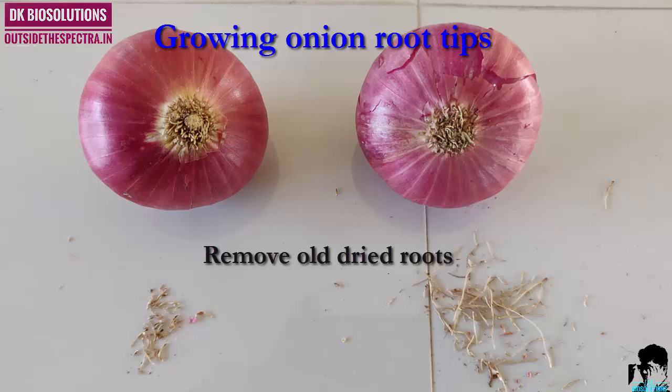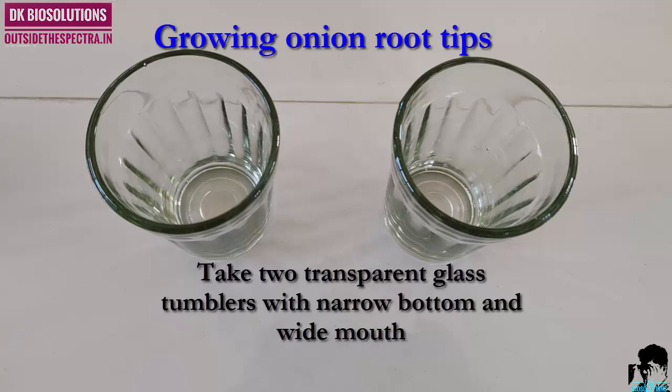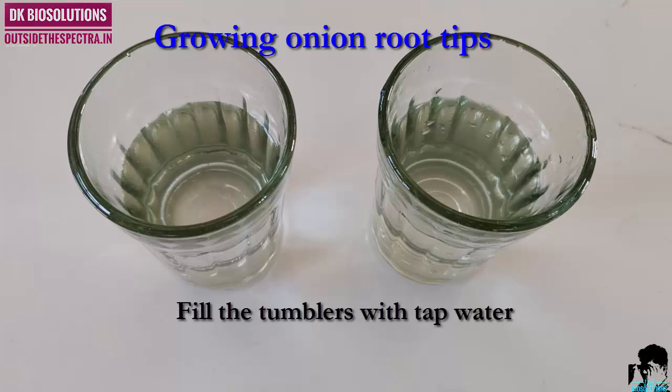To grow onion roots, we need two onion bulbs and two glass tumblers. Fill the tumblers with water — you can use normal tap water.